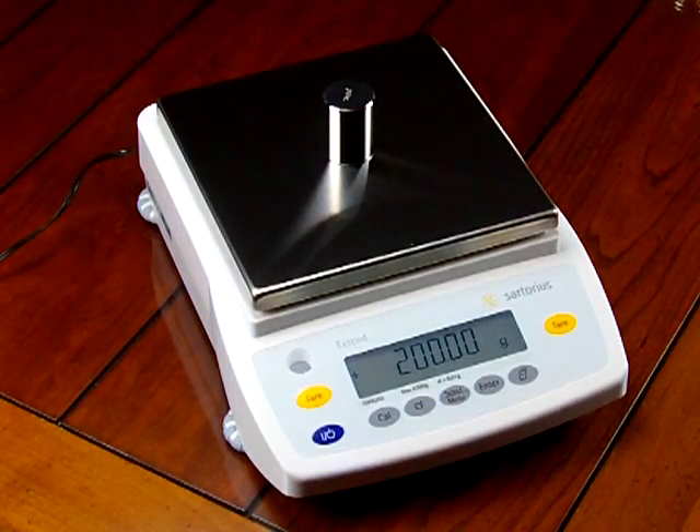The GW6202 is top of the line. Some more benefits to look at when comparing balances: what's the manufacturer's warranty? Sartorius offers a 3-year limited manufacturer's warranty. All warranties are under general use. We're seeing some competitive brands lowering their warranties — one brand is lowering to one year. We question why. Sartorius has a 3-year limited manufacturer warranty.